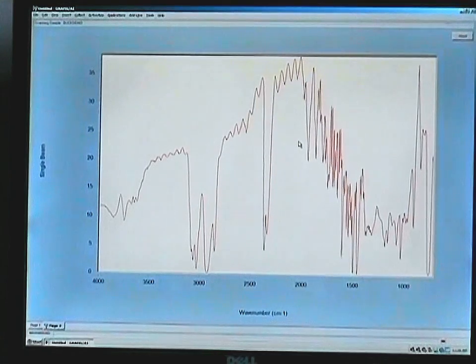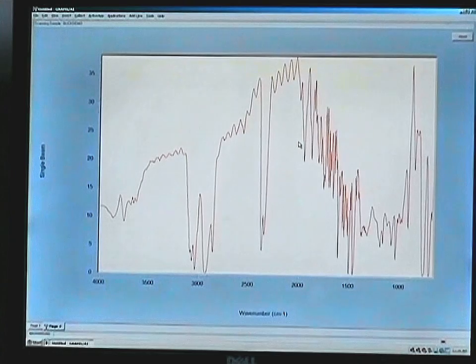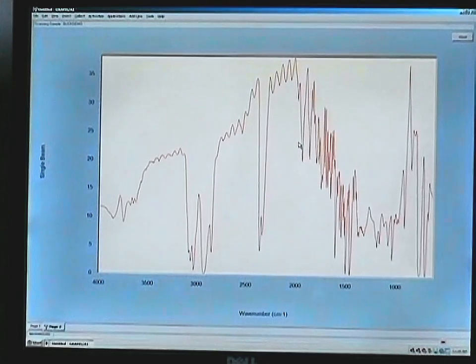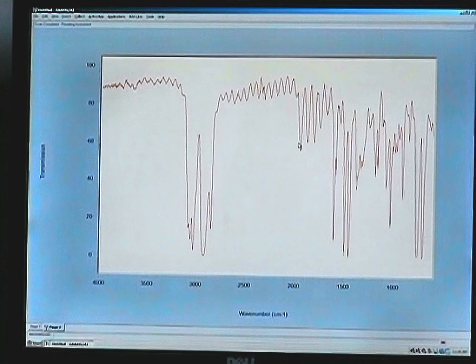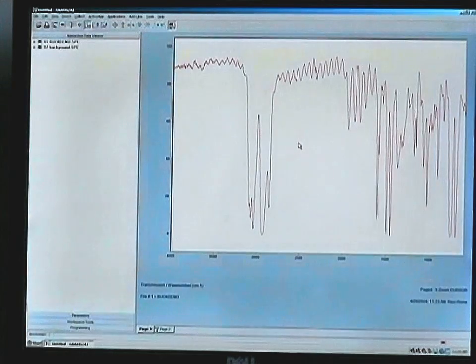In the auto ratio mode, once the single beam spectrum of the sample has been collected, it will automatically reprocess it and display the percent T scan as shown here. Please be aware that if it is necessary to save the single beam raw data files for each sample, you should not use this procedure but collect the single beams directly and ratio them afterwards.